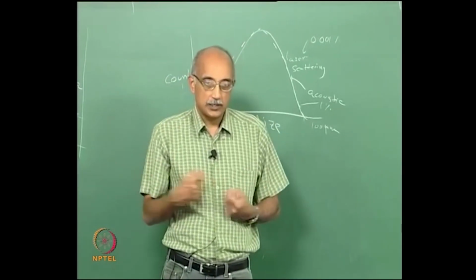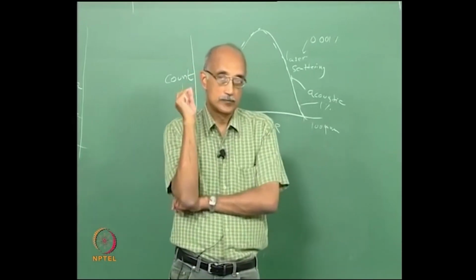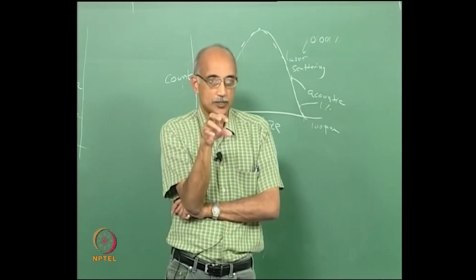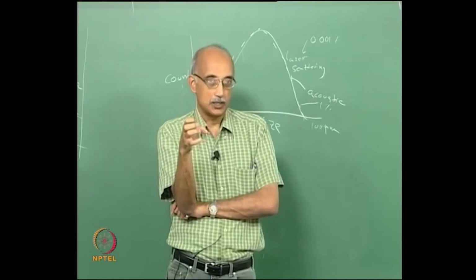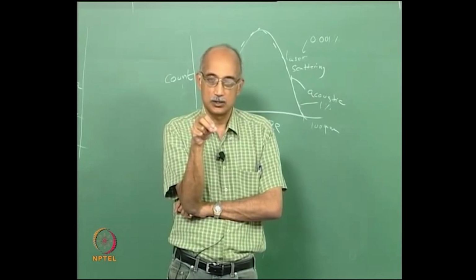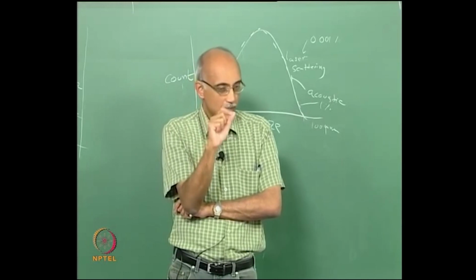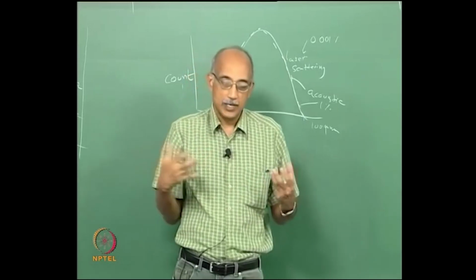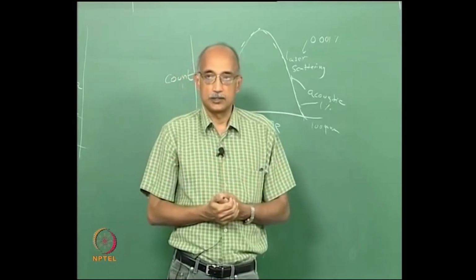Nanoparticles have a clear tendency to agglomerate. So when you are trying to measure the size of a nanoparticle, it is very, very difficult to do so, because by the time you get ready to do the size measurement, it has already moved, found its nearest neighbor and attached itself to its nearest neighbor. So every time we try to actually measure the size distribution of a sample containing nano dimensional particles, what we are really measuring is not the size of the individual nanoparticle, but rather the size of a conglomerate of such particles that are adhered together.